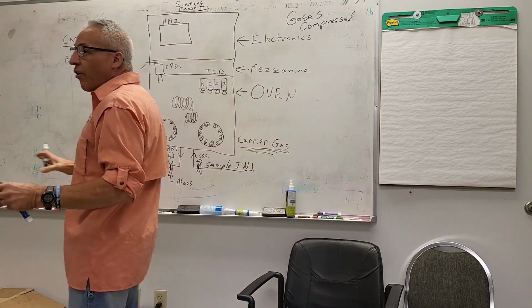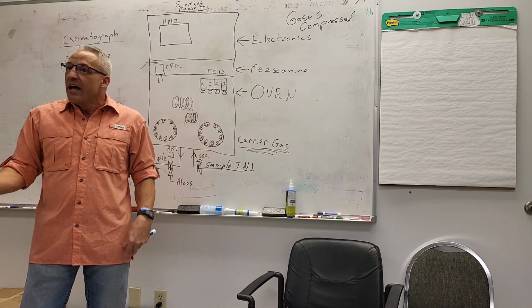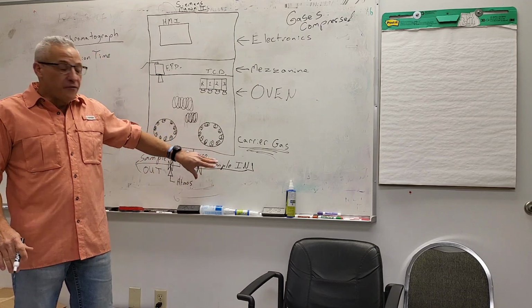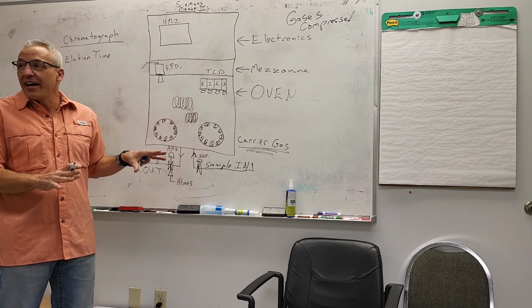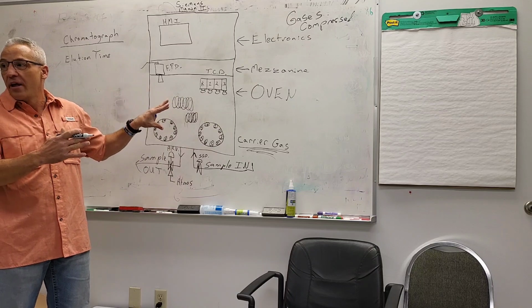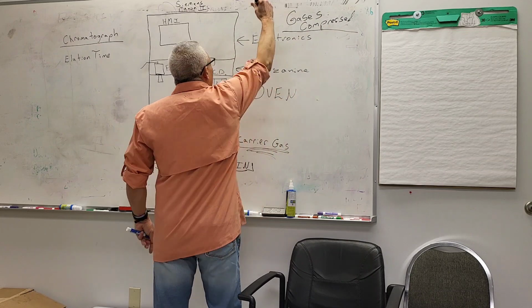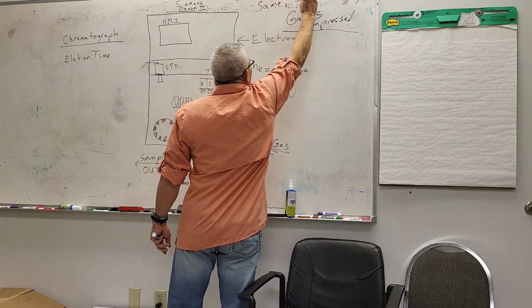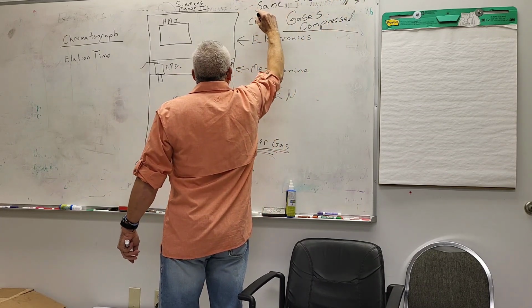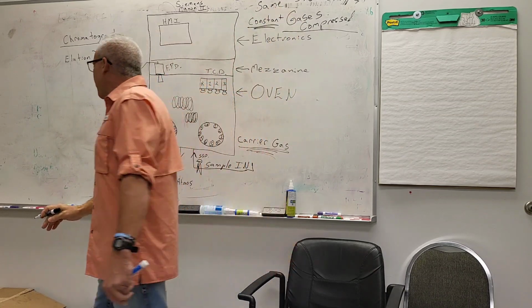So what we do in all GCs, Yokogawas vent for 10 seconds, ABBs, I'm not sure how long y'all vent, Maxums 8 seconds, but you're going to stop the sample, vent to atmospheric pressure for 8 seconds on this one, and then you inject. That way you have the same size sample every single time. Due to gases being compressed, we are going to vent to atmosphere and get the same size sample. That is a constant. GCs are built on constants.